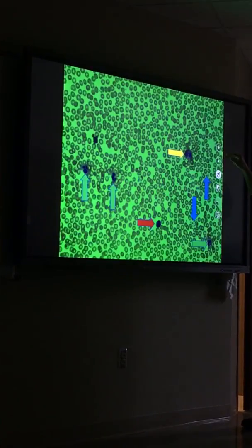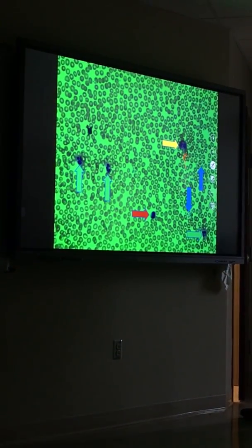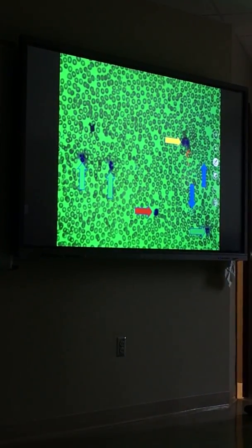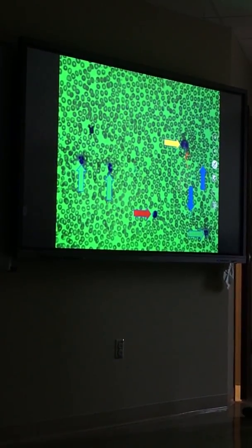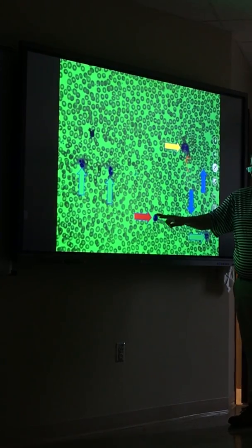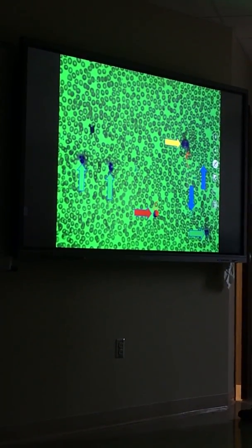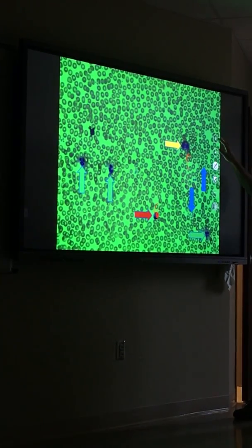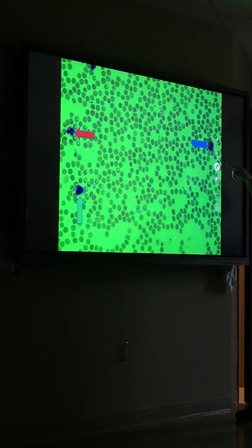Probably a basophil there. Here is a nice eosinophil with a red tint, right? And the nucleus can be bilobed, although we saw it one day with 3 lobes in one of the other classes. Somebody showed me one. So neutrophil, lymphocyte, once again, look, solid black nucleus with a drop of cytoplasm. And then neutrophils over there, but that's an eosinophil there. Another eosinophil there in blue.